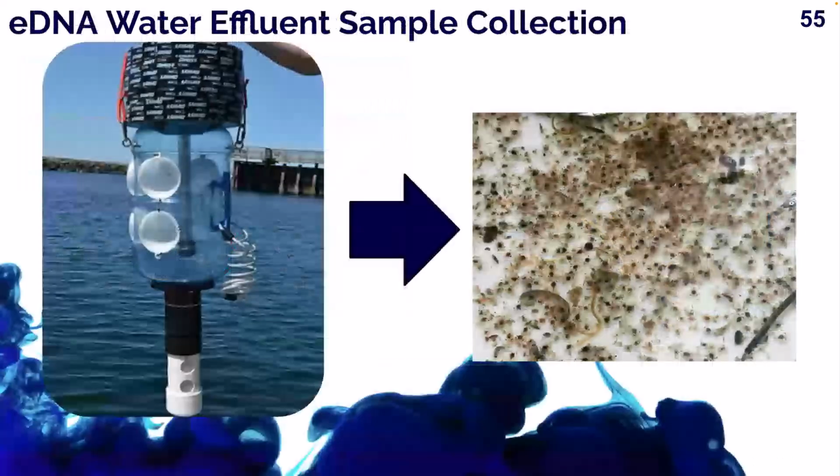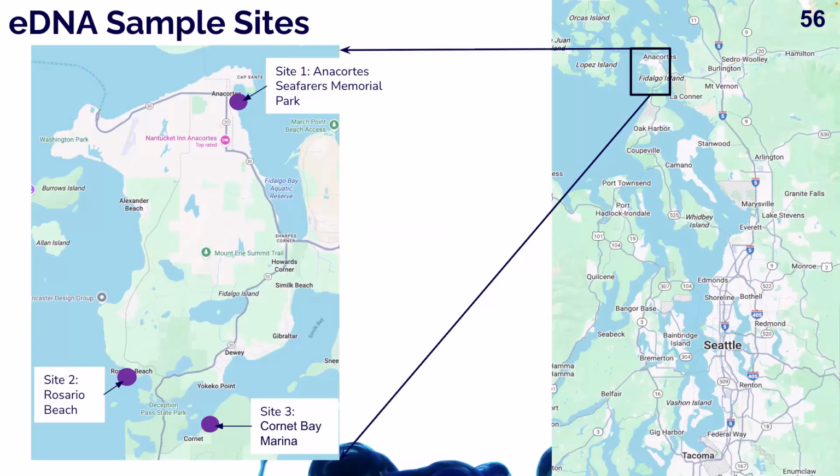And so to show more of this assay's application, and especially into improving this larval data, we want to see, can we collect the water from these light traps to get an estimate of the larvae, saving time and money, and also possibly help increase the survey size and data generation. So with the help of Sarah Grossman, she is a Swinomish tribe environmental specialist.